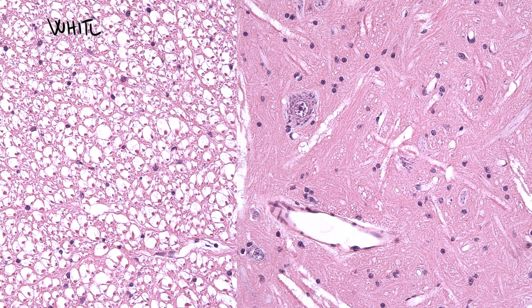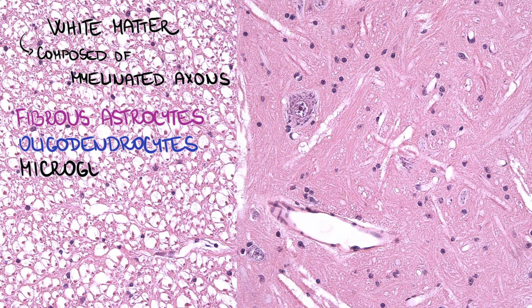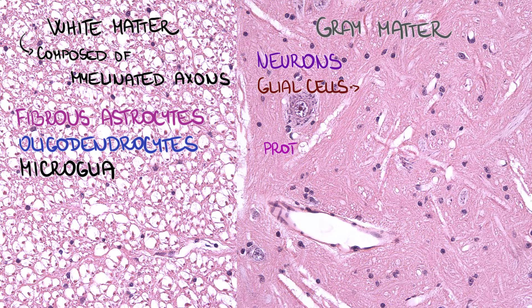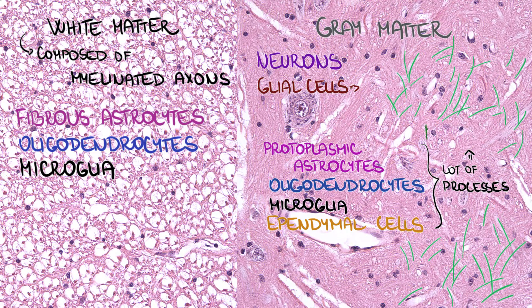Just a brief recap: white matter is composed of myelinated axons, and we can find glial cells such as fibrous astrocytes, oligodendrocytes, and microglia there. Gray matter contains neurons and glial cells such as protoplasmic astrocytes, oligodendrocytes, microglia, and ependymal cells. We differentiate glial cells based on their nuclei, but they have a lot of processes. These processes, together with dendrites and axons, create a meshwork in gray matter called neuropil.